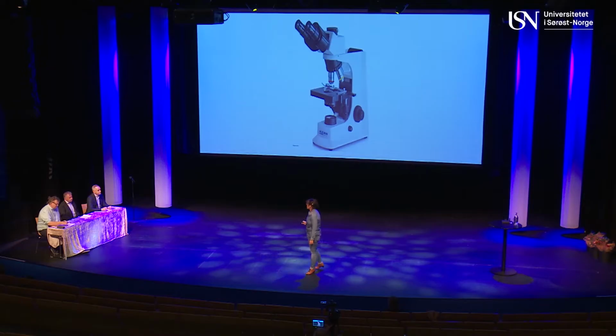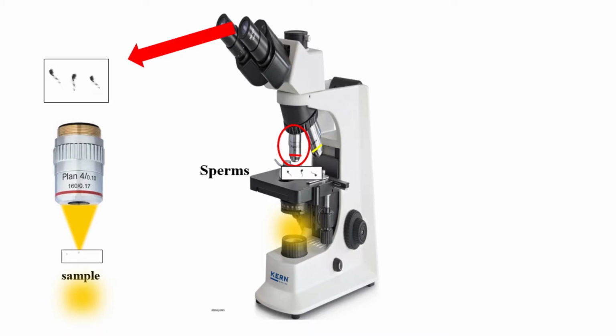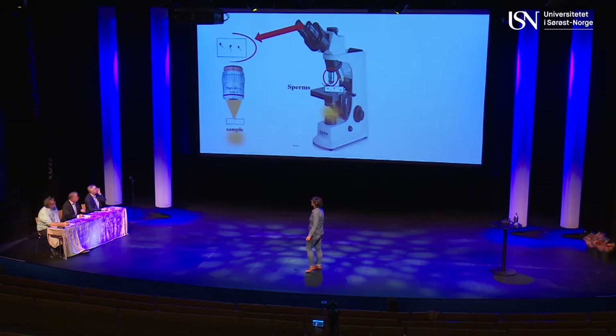This developed microscopy is a combination of both experimental and also programming. So let's go through it. At first, we illuminate the microscope and choose one sample, which is sperms. I have chosen them because they are really important in nowadays life. That's how it looks. And we magnify the image of this sample 4 times bigger, as you can see here.